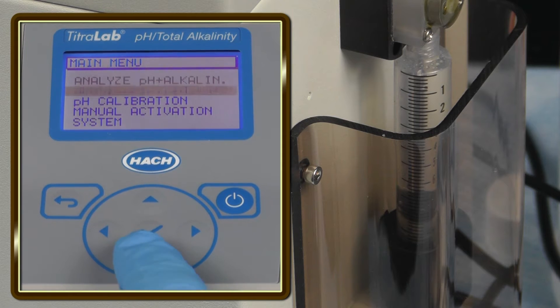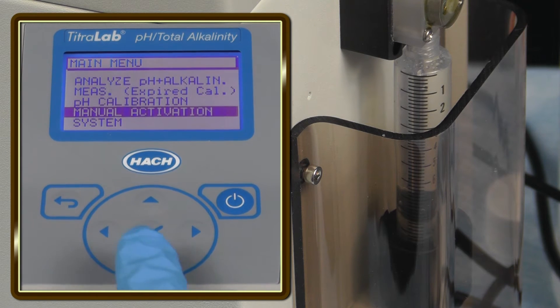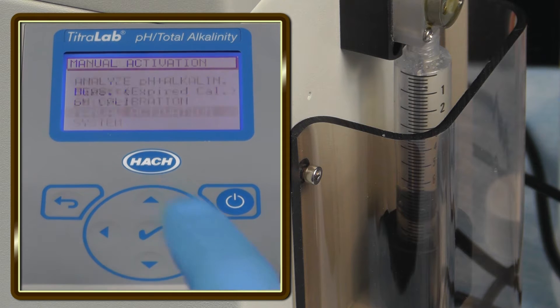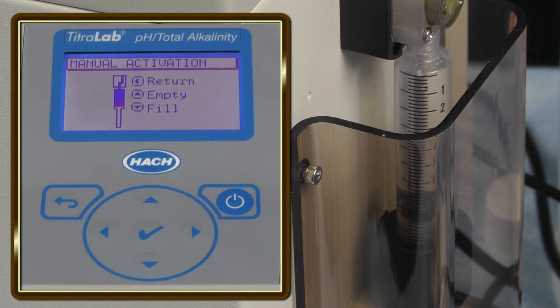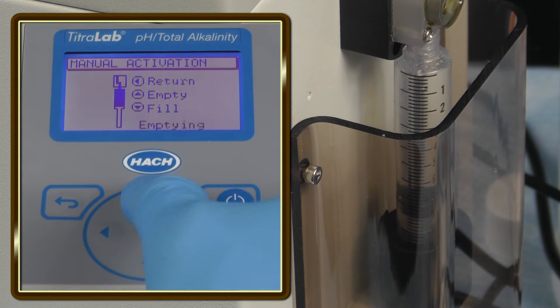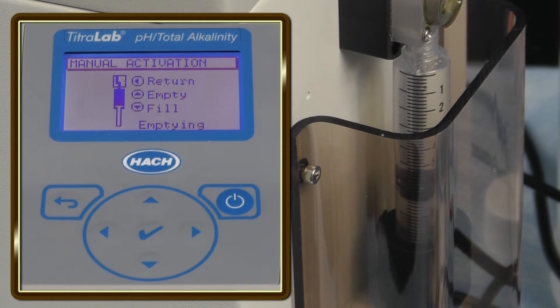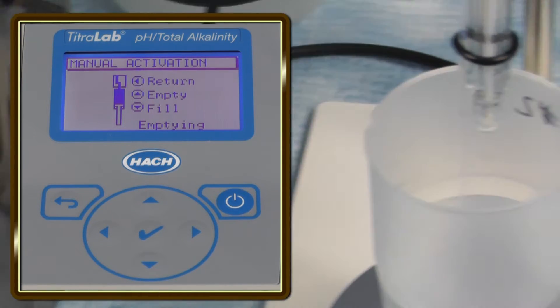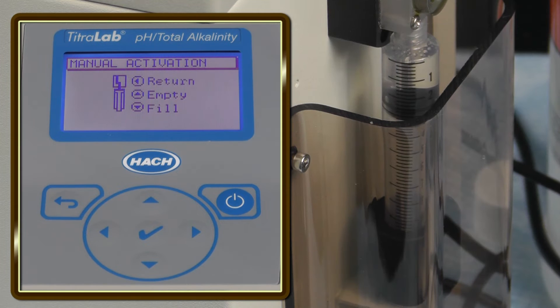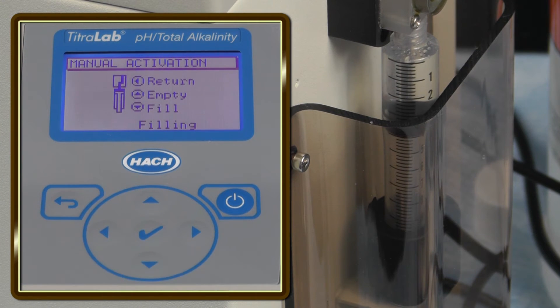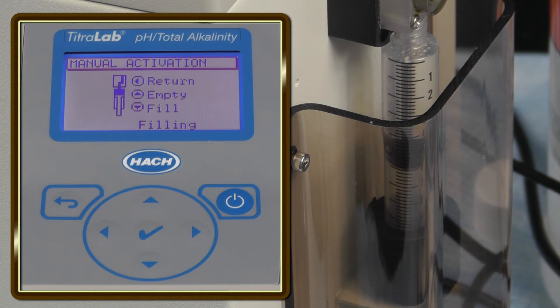On the keypad, scroll to Manual Activation and select Buret. Make sure there is a waste beaker under the electrode. Press the up key to empty the syringe and the down key to fill the syringe. Do this several times until all the air is removed from the syringe and tubes.